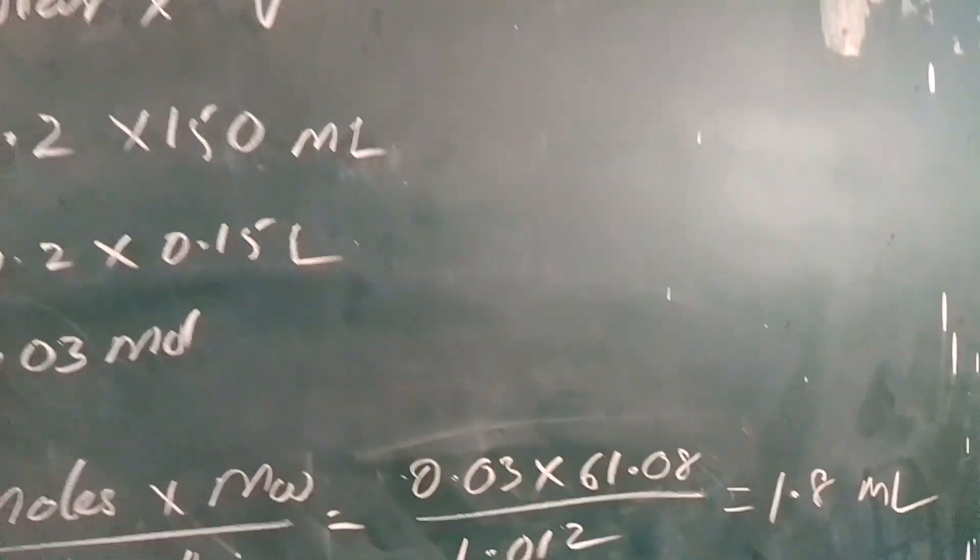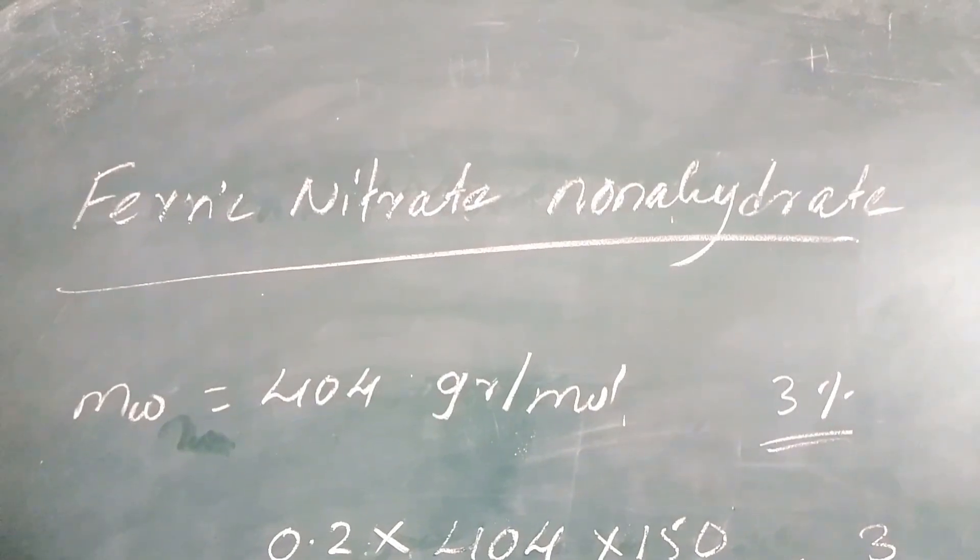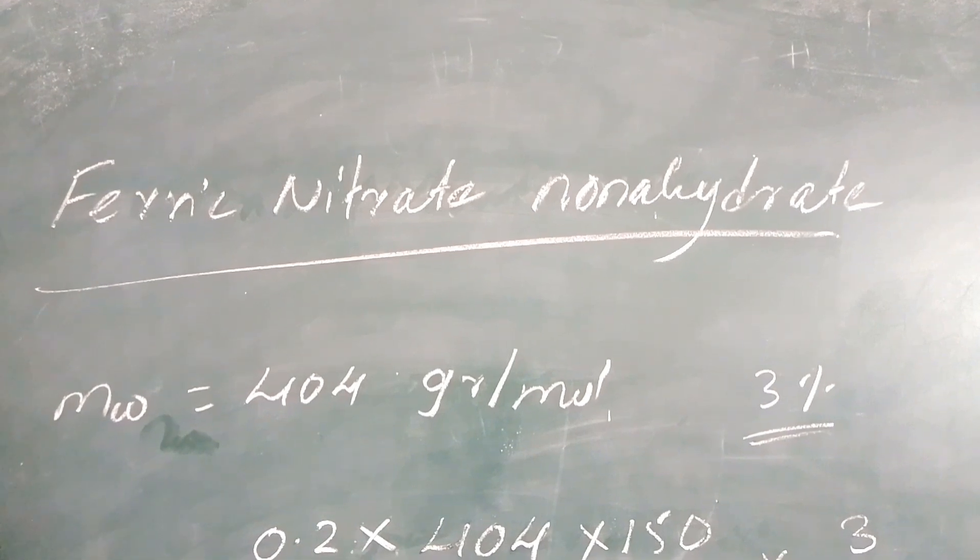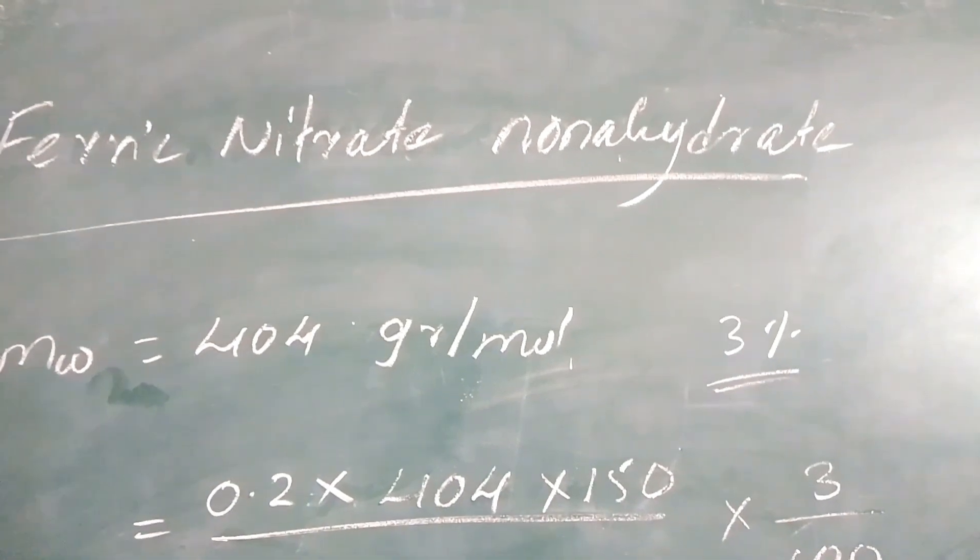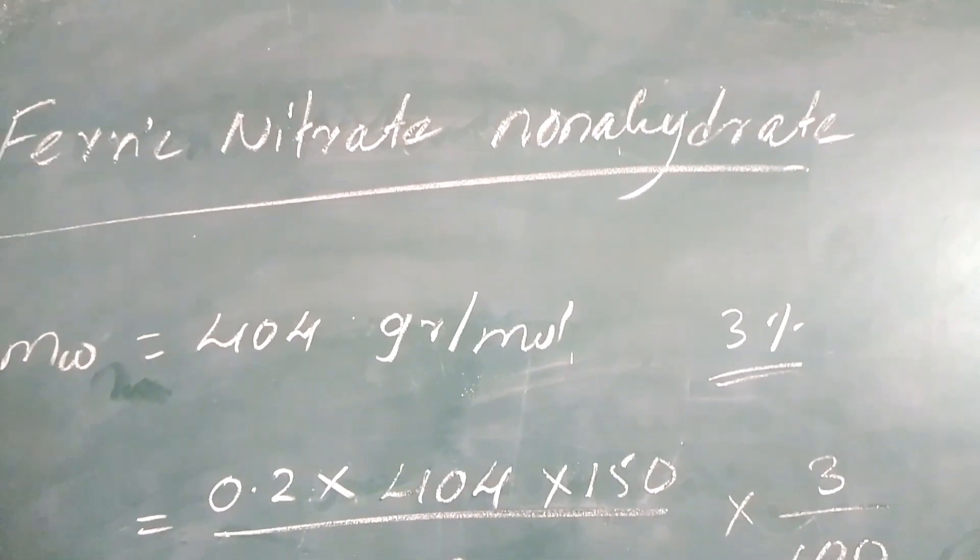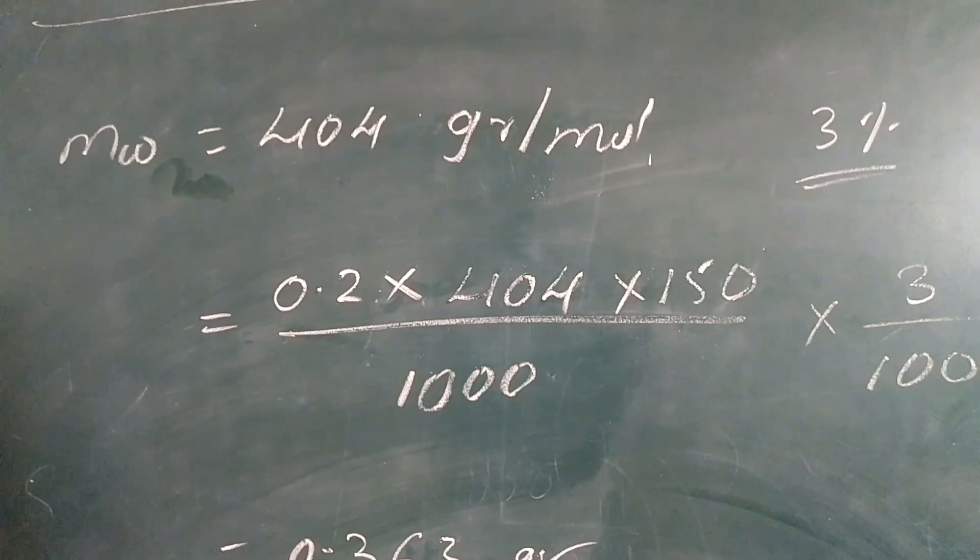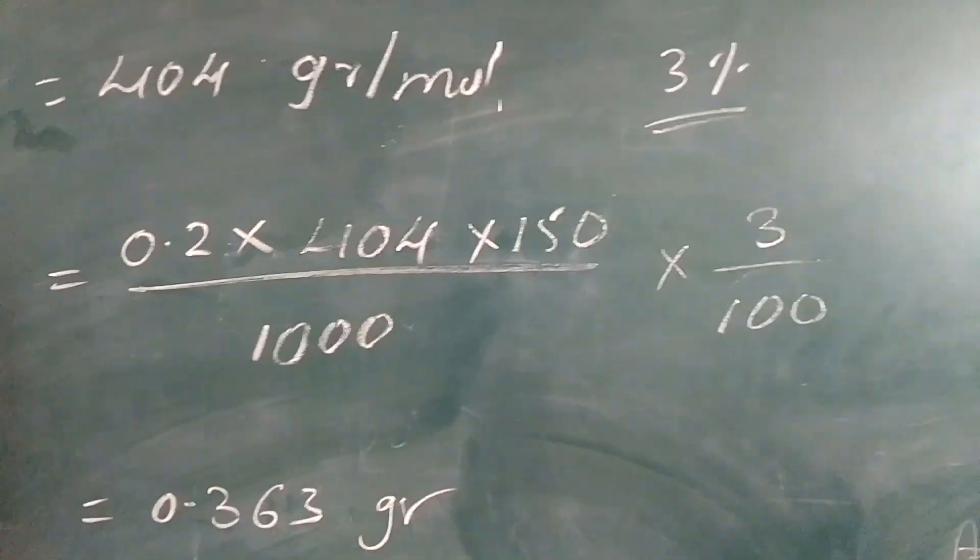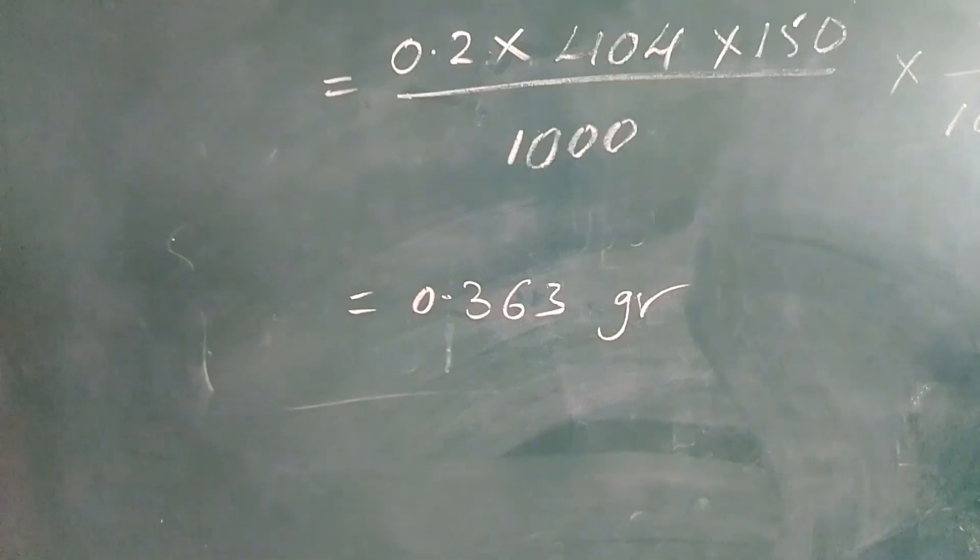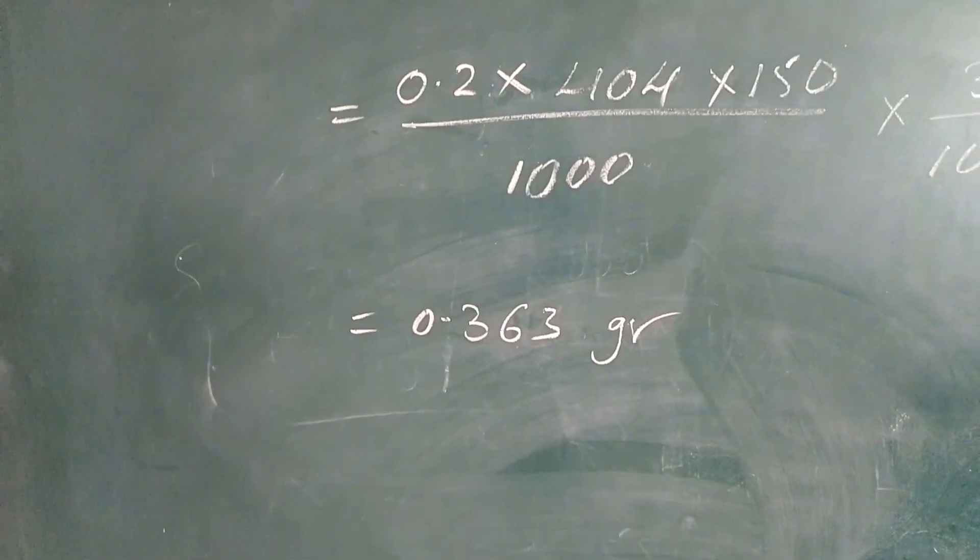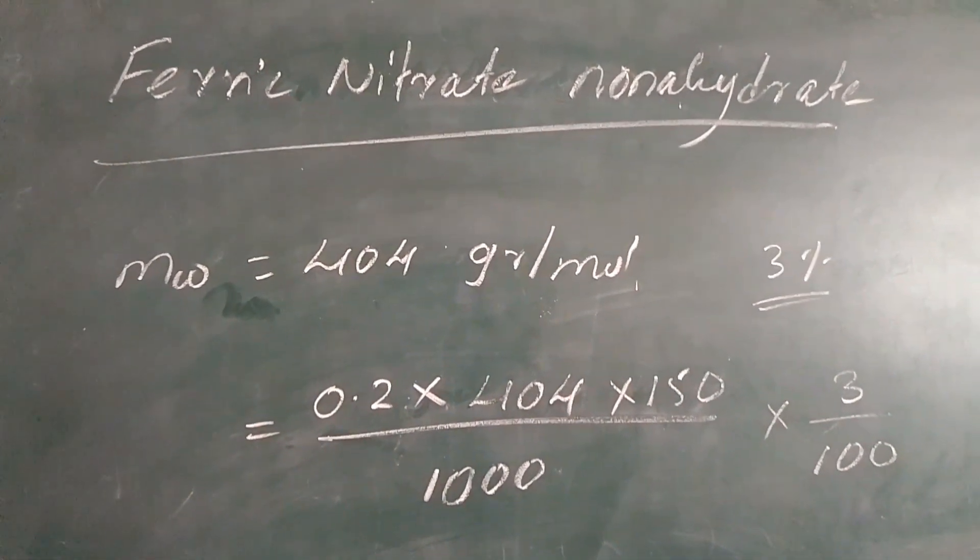In this process I am going to add monoethanolamine of volume 1.8 to 2 ml. For doping purpose here I am going to make use of ferric nitrate nonahydrate as the source of iron doping. The corresponding molecular weight is 404 grams per mole. I am going to add 3 percent of this compound, so 0.2 times 404 times 150 divided by 1000 times 3 by 100, which is approximately equal to 0.363 grams.